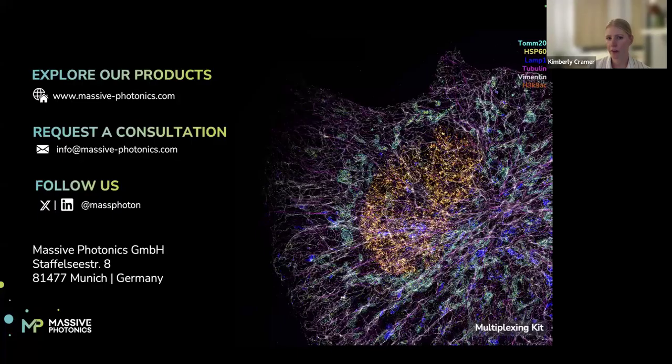I think it's a great contender for this, and I think it will. Recently, there have been a lot of advancements in multiplexing, and people are looking more into automation for DNA-PAINT and fluidics exchange. Combined, these advancements will enable us to look at a lot of targets within a cell in a shorter amount of time.